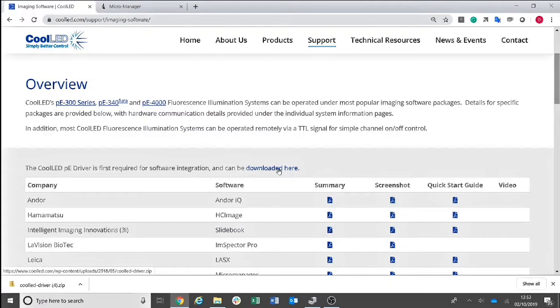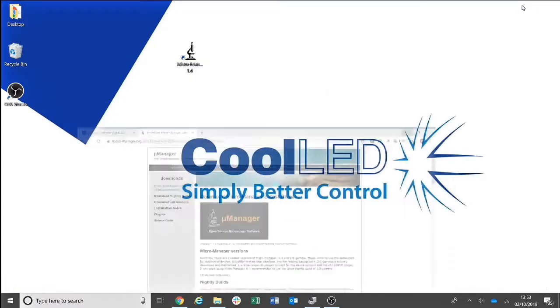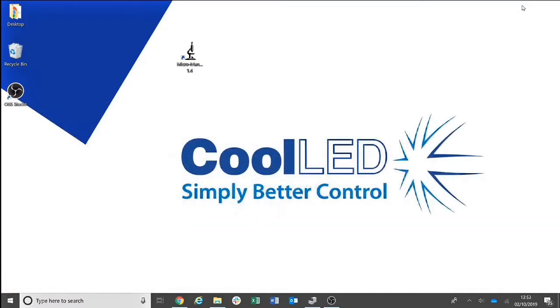You will then need to ensure that you have the latest Micromanager software downloaded. This can be found on the Downloads page of the Micromanager website. Once you have both installed, you can then plug in your CoolLED light source.